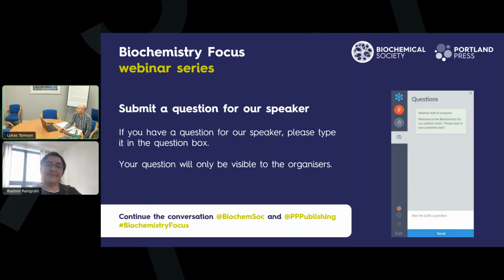Sergi Consolato asks, there are advantages and disadvantages linked to microscale thermophoresis. However, one major disadvantage of label-free thermophoresis is that protein-protein interactions cannot be measured, as generally most proteins have enough aromatic residues to generate an interfering signal. Can you please give more details of your experience with microscale thermophoresis?